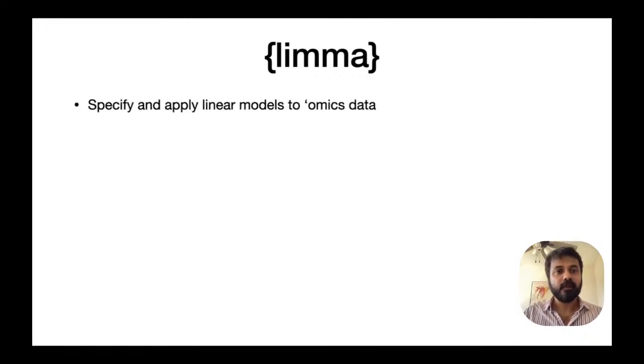So this limma package, what it does, it's a package that allows us to specify and apply linear models to all kinds of omics data. Unlike simply just doing t-tests for all your genes, what limma allows you to do is compute what's known as a moderated t-statistic.